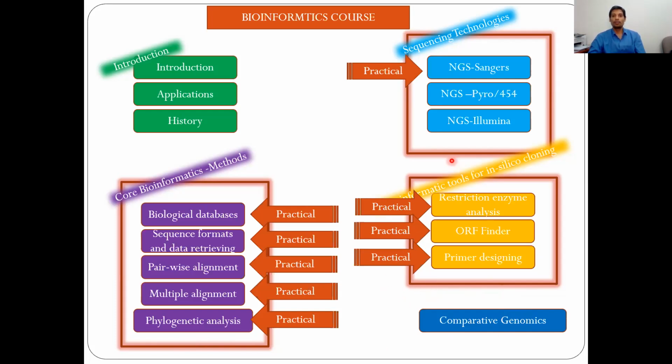So this is once again a mind map of what you are going to learn, or what you are learning. Now we will continue with the Illumina sequencing.